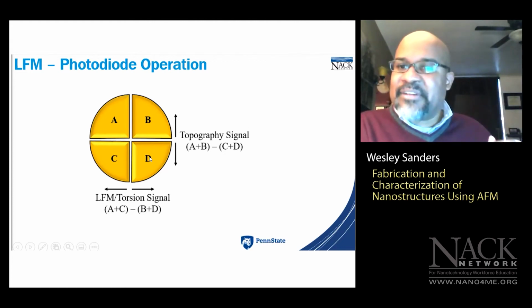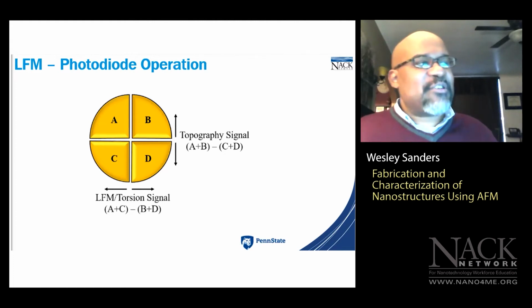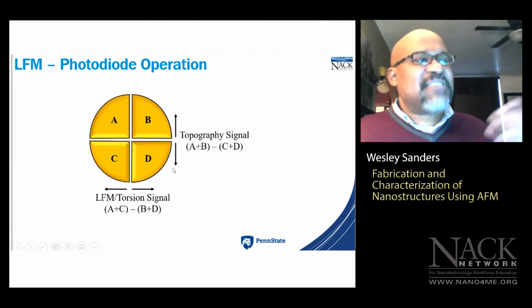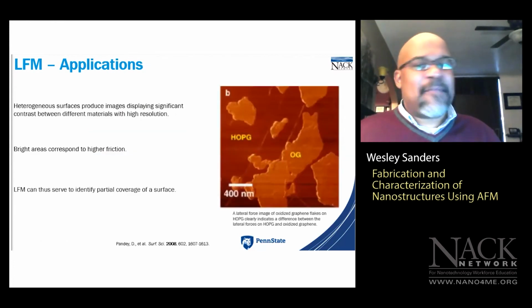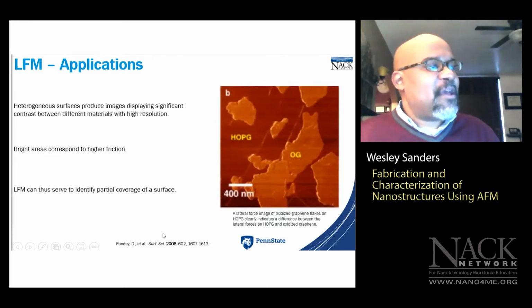So that comparison allows the system to record frictional data. So that's how you're able to record surface topography and friction simultaneously while conducting an LFM scan. So this is a really nice image that I pulled from an article that comes out of Surface Science, a 2008 article from Surface Science.